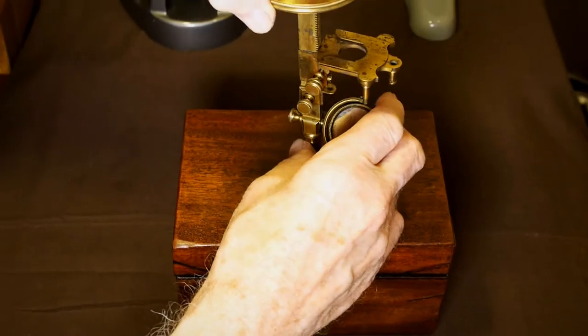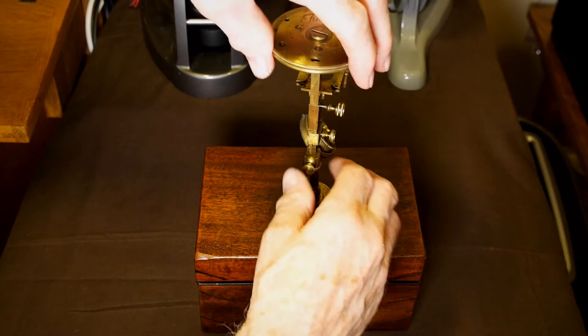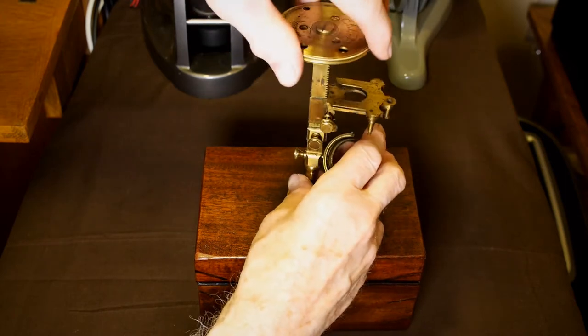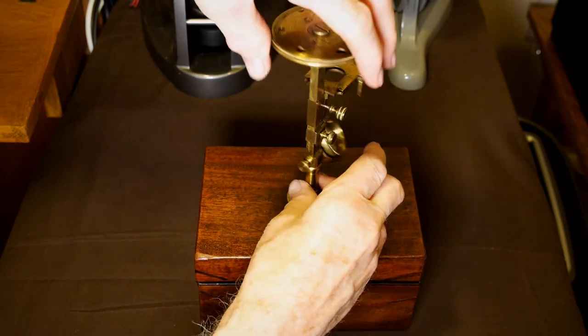This brass microscope has six round glass lenses ranging from x5 to x60 magnification, which are mounted between the rotating turret plates.